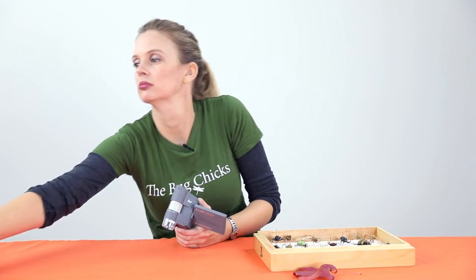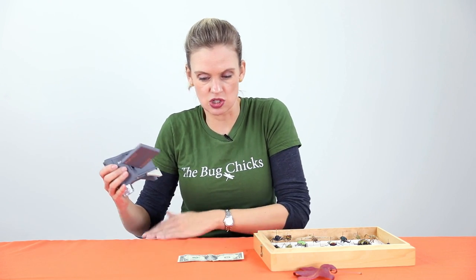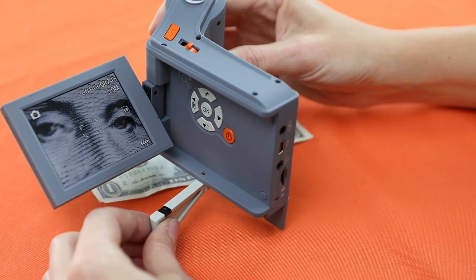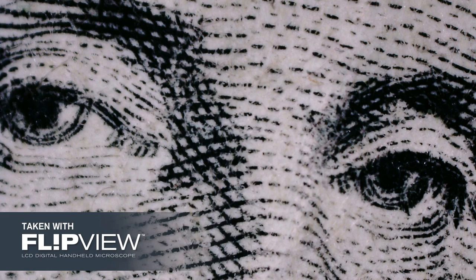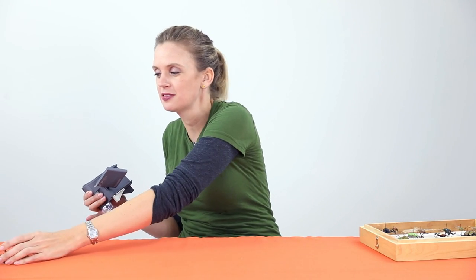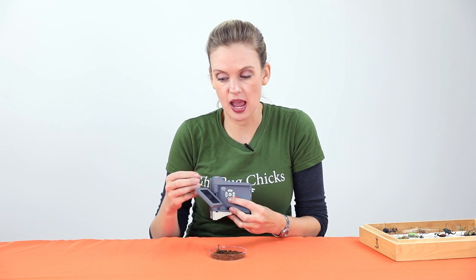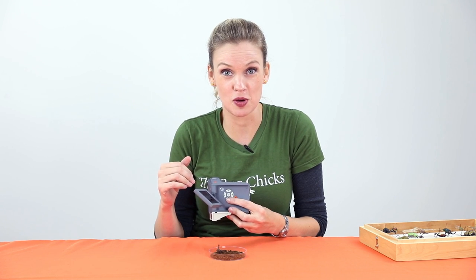Or anything that's flat — like, let's look at a dollar bill. Simple dollar bill. I want to take a picture of George Washington's eyeballs. Perfect. Now the FlipView also takes video, so if I wanted to switch to something that was moving and alive, all I have to do is hit this down arrow and it displays all the pictures that I just took, then hit it again and you're in video mode.